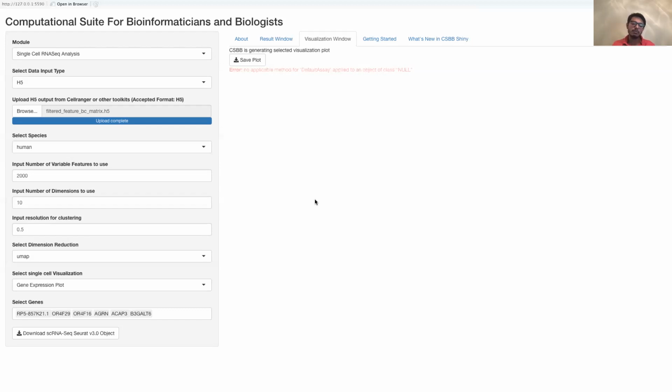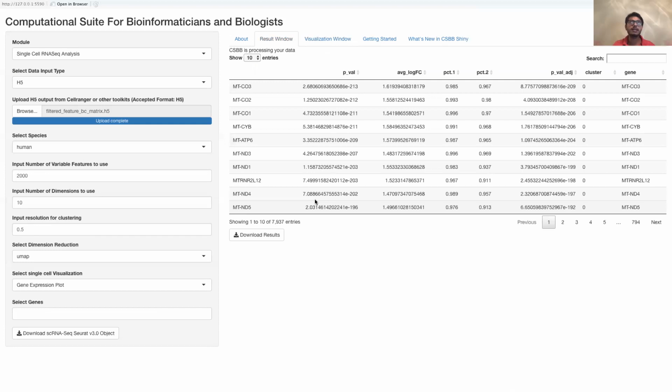But from my experience, I have worked on a lot of different single cell datasets, and it just works great. I think it's very easy to use, very easy to understand. That was one of the reasons why I added it here for the first go. But thank you again for your time and patience.